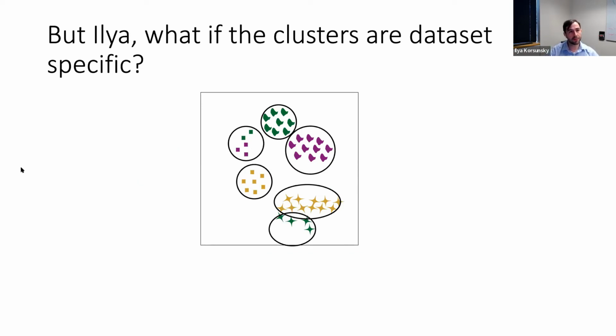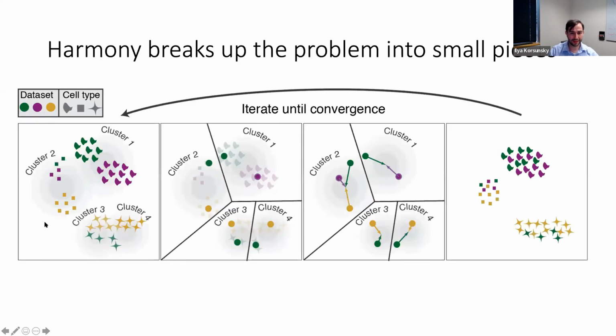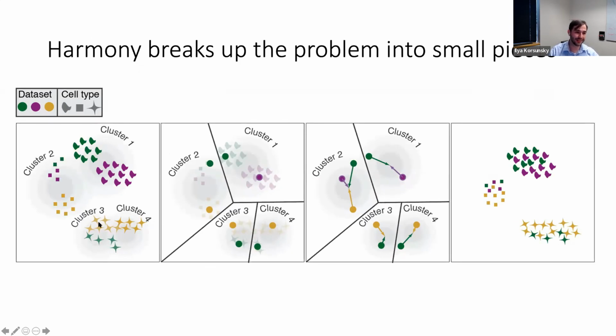trajectory. So in the paper, we did actually analyze a developmental hematopoietic trajectory in the manuscript, and I wish I put it in the slides. I didn't, but I can point to this in the toy example. I can point to clusters 3 and 4 here. We can imagine that this is some kind of trajectory that goes from cluster 3 to cluster 4, and the way that we handle this is by using soft clustering, right? And so we don't force this trajectory into discrete clusters. We keep the trajectory shape. Well, one particular example, usually CD4 and CD8, I don't see them separate so well. Yeah.